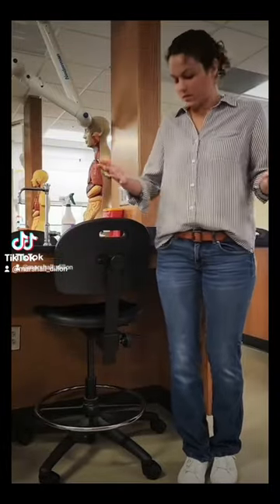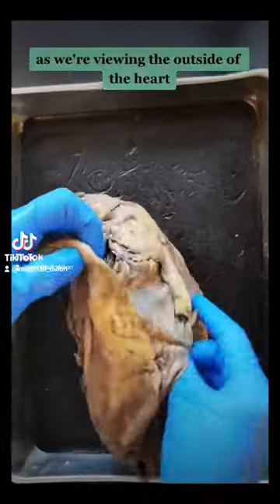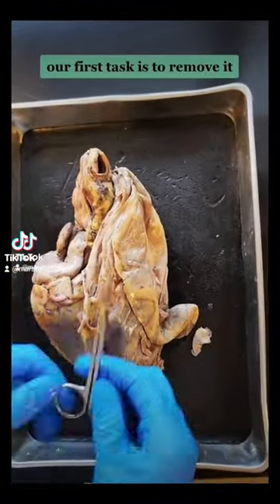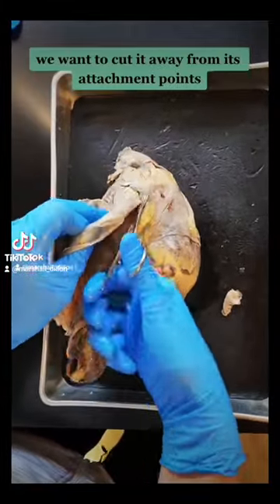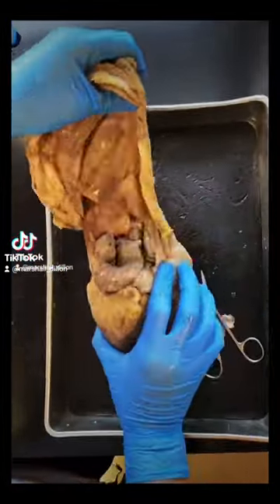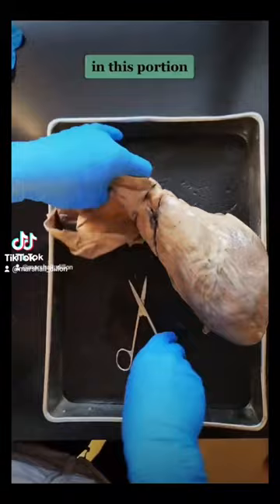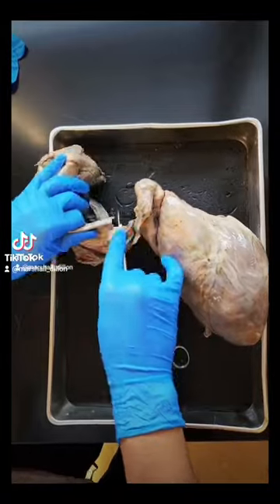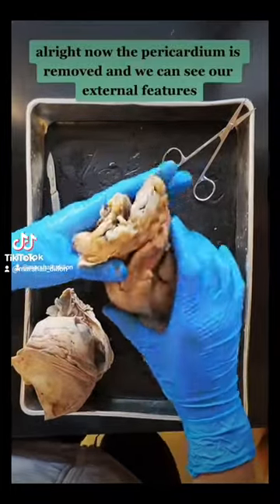Let's get ready for our heart dissection. As we're viewing the outside of the heart, we notice this protective sac called the pericardium. Our first task is to remove it. We can remove it using scissors, cutting it away from its attachment points. In this portion it's a bit too thick for the scissors, so we'll carefully use our scalpel. Now the pericardium is removed and we can see our external features.